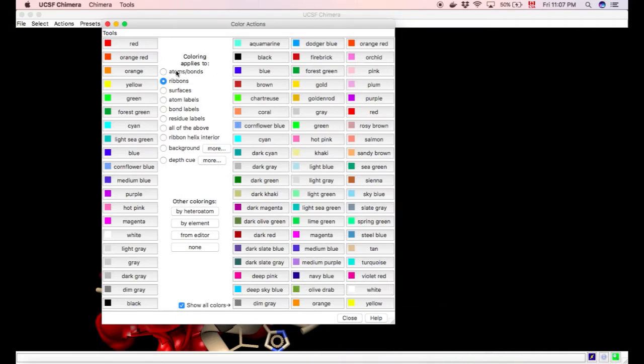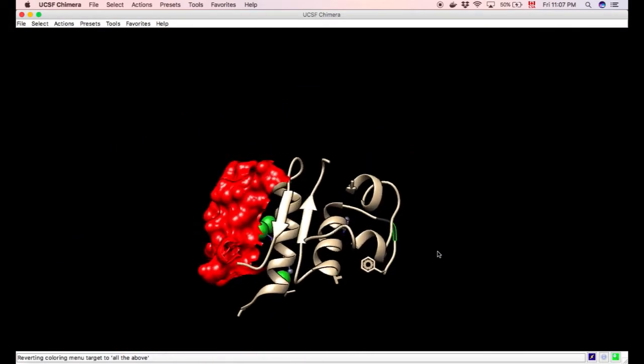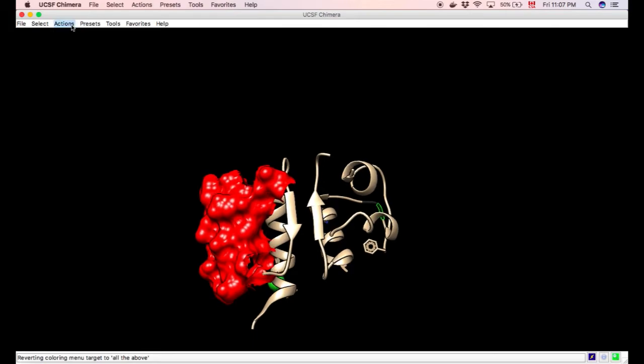Okay? But preferably, usually it's protein imaging. It's nothing too fancy. But if you're really a fan of, let's say, goldenrod, or very, very much a fan of olive drab, well, you have these options also, aside from these more classical colors. Okay, this looks pretty much like a mess, but we'll change that very soon.